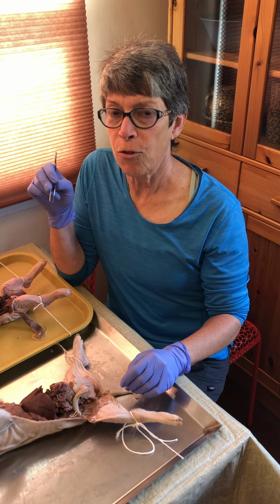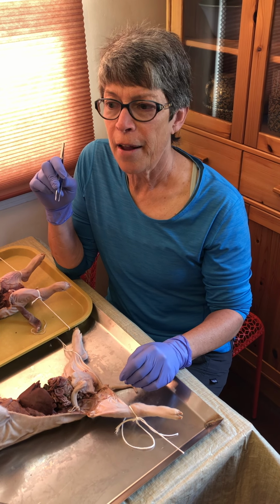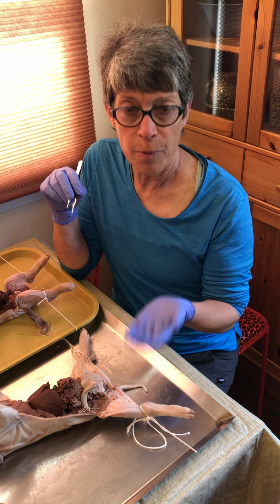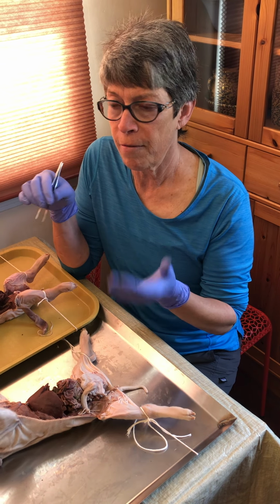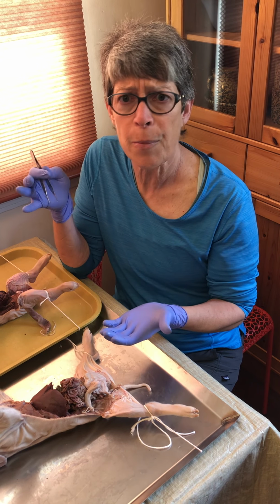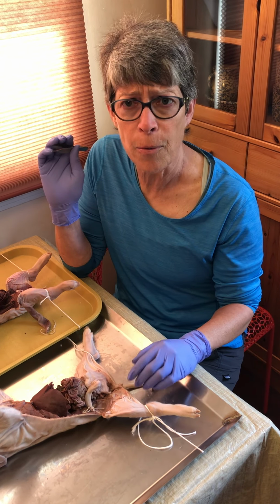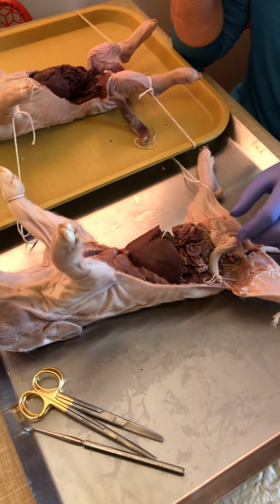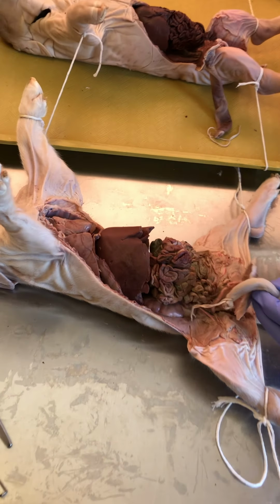Folks, next up is the urogenital system, and that's going to mean the urinary system and the reproductive systems. Because the male and female urinary systems are so similar, we're just going to do it all in one tour. So here we go. We have a female right here, male here. We're going to start with the female.